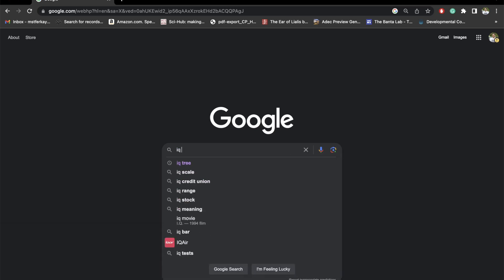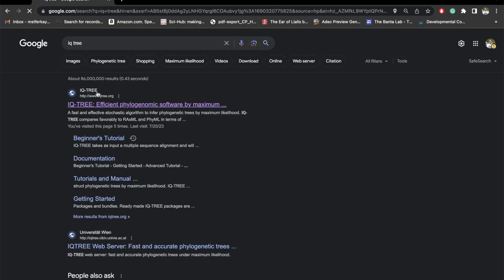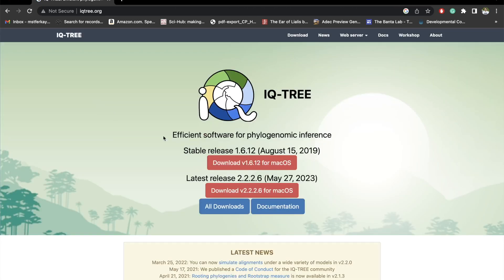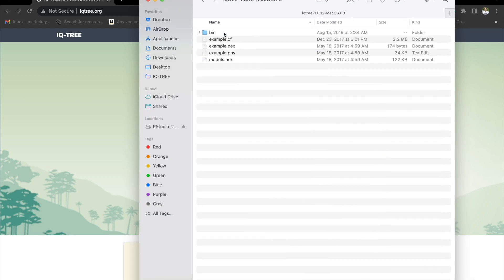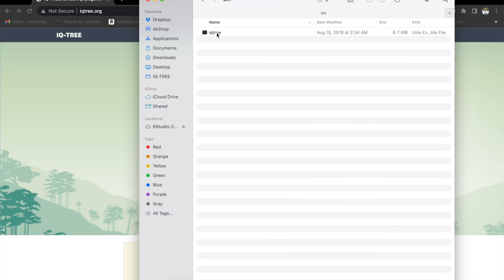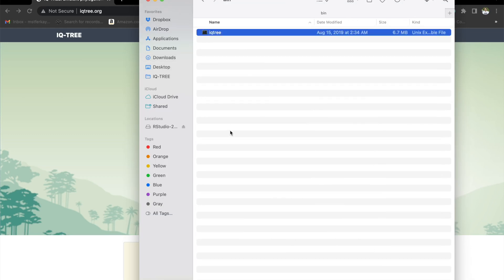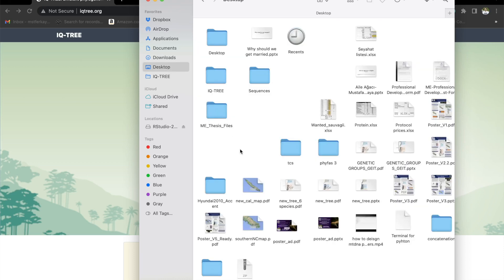Let's start with downloading IQtree. Today I will be using the stable release. Click on download. From downloads, go on IQtree, bin, and IQtree. Copy this. Let's go on desktop and create a new folder — let's call it IQtree trial.